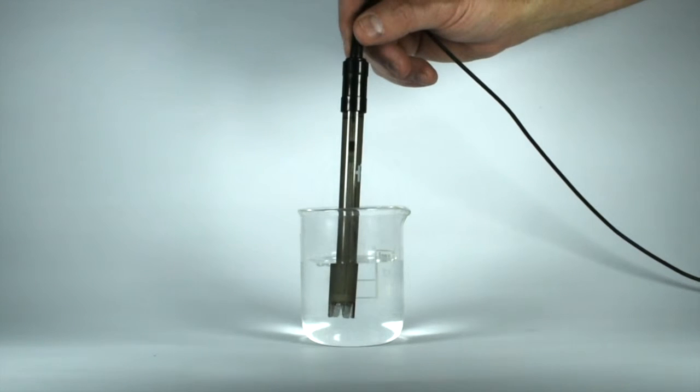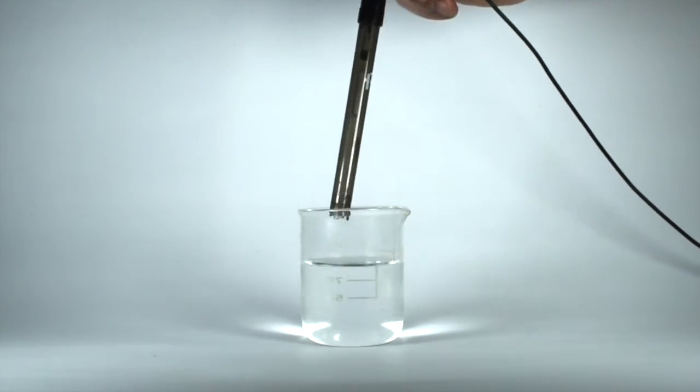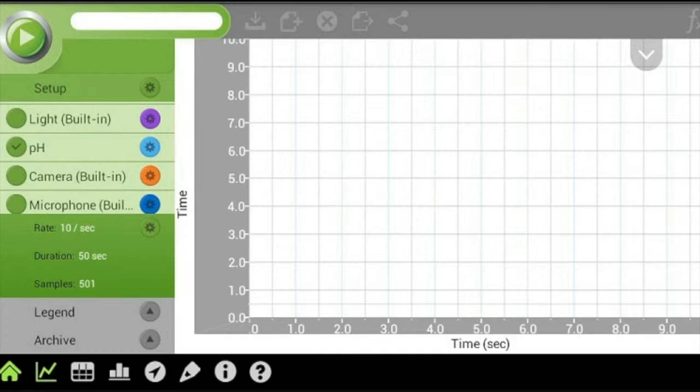To take a measurement, insert the electrode into a sample. Then select Run.